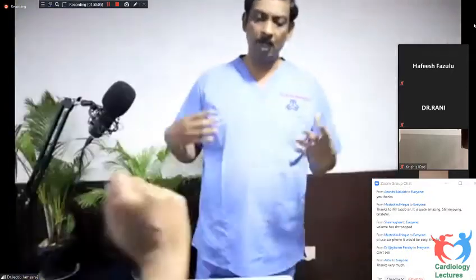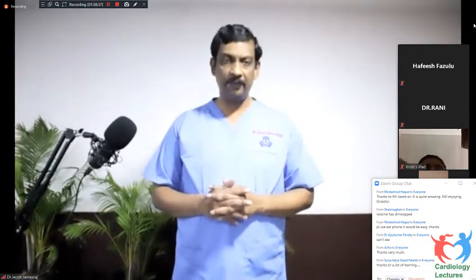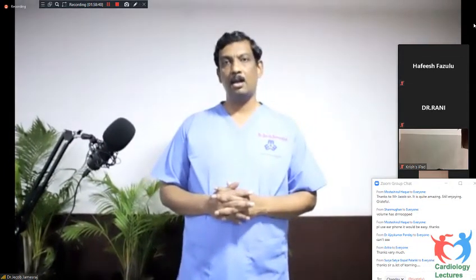This is a scanning electron microscopic view of a Purkinje cell approximated to the cardiac muscle cell. See the branching structure, it is just on the muscle cell. This is another colored scanning electron microscopic view. See the green one is a Purkinje cell, and it is branching and closely approximated to the muscle cell, which is cardiac muscle, which is red.